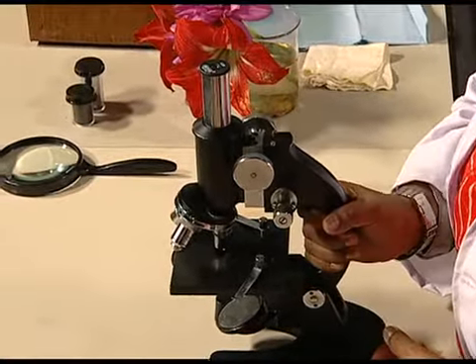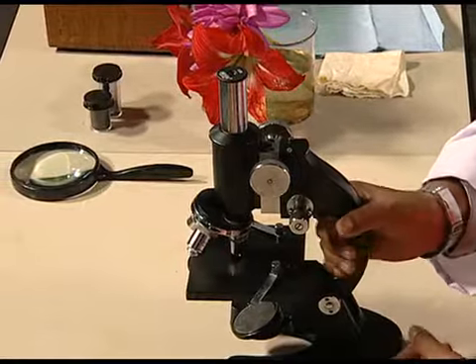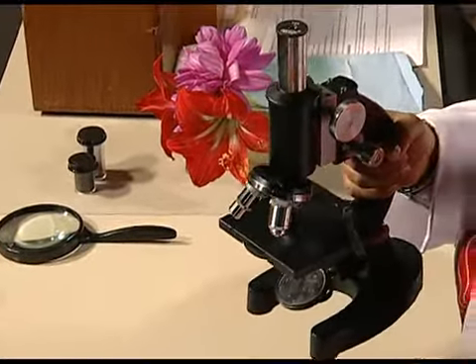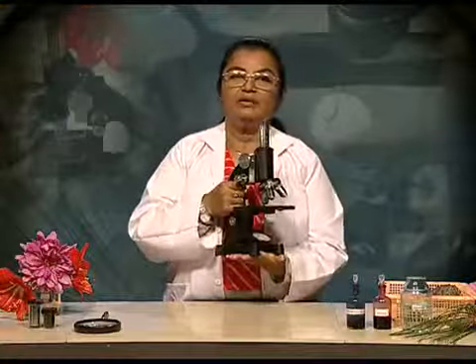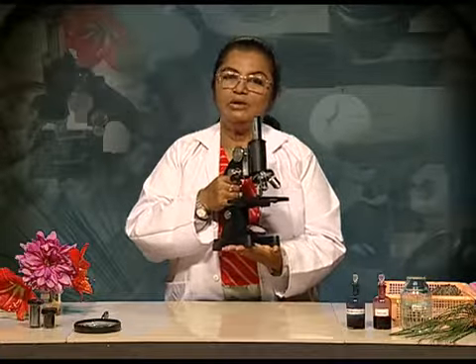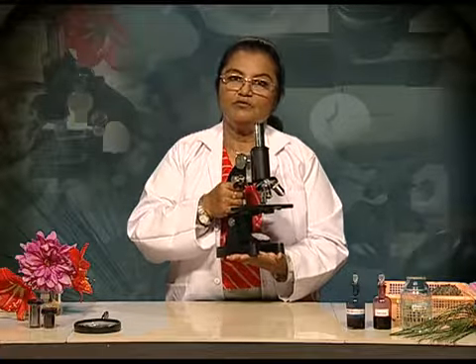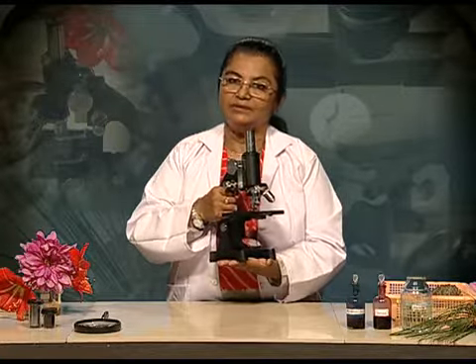Hold the microscope with both hands, one hand holding the arm of the microscope and the other hand firmly placed below the microscope when you are shifting it from one location to another.